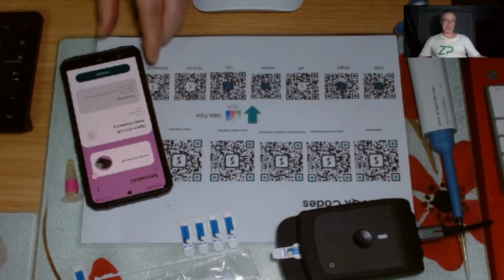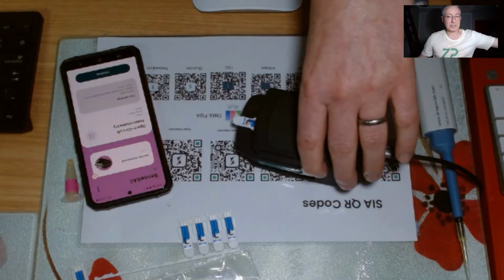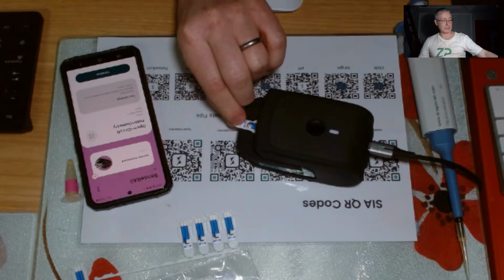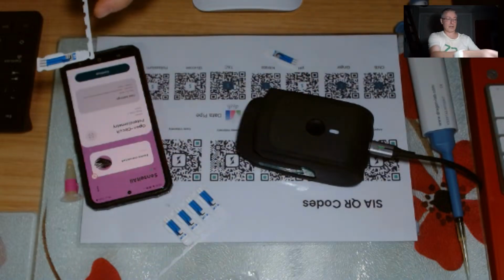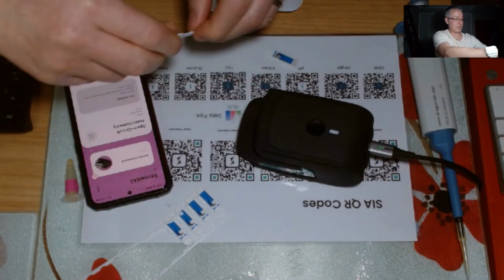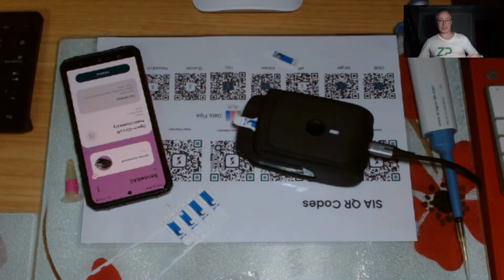It's a very different type of potentiostat. It doesn't look like a potentiostat. It takes electrodes from ZP, I'll just plug them in. There we go. And in a bit, I'll do a quick demo on that as well, so you can see that in a bit more detail.